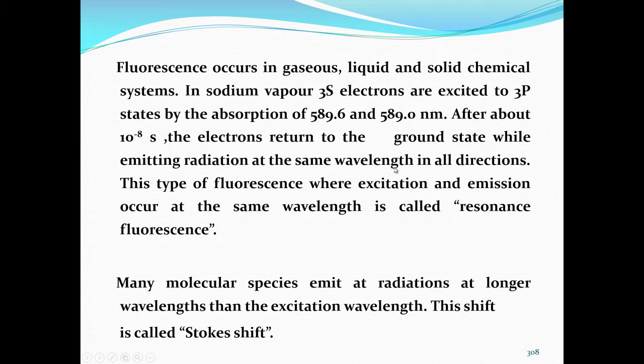Here the sodium vapor absorbs; 3s electrons of the sodium vapor, vapor means basically element, get excited to the 3p state, that is the energy state, and after about 10 raised to minus 8 seconds the electrons return to the ground state while emitting radiation at the same wavelength in all directions. This type of fluorescence, where excitation and emission occur at the same wavelength, is called resonance fluorescence, and many molecular species emit radiation at longer wavelengths than the excitation wavelength. This is called Stokes shift.